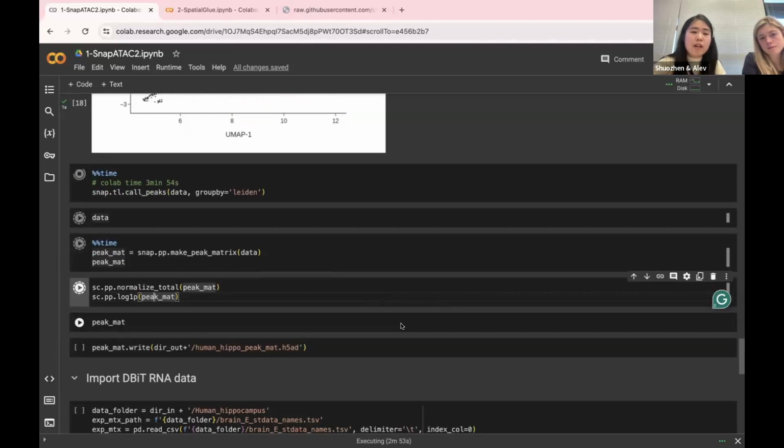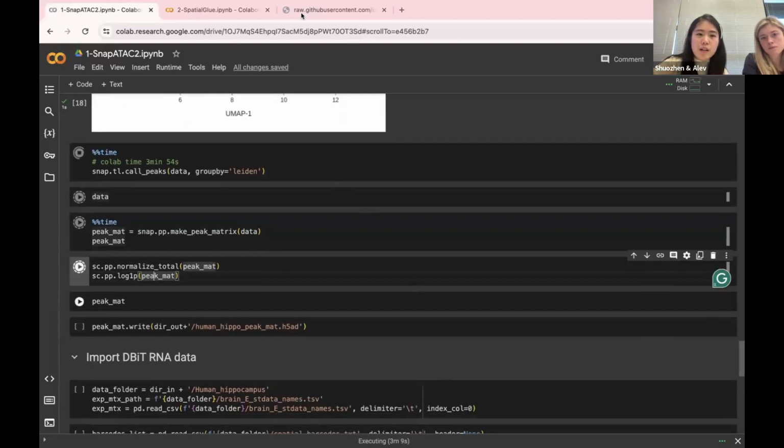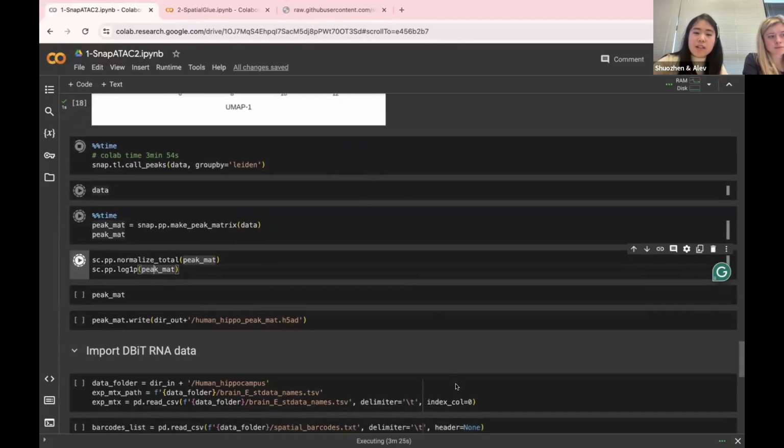each location should have their differentially expressed genes or different open accessibility of the chromatin, right? So even if it's a mixture of the cells, different locations should have different open accessibility. So we first do the ATAC data analysis using the single cell pipeline. And then, once we have the unsupervised clustering of those differential features, we map it back to the spatial location. With the spatial location, we can do the pseudotime analysis and also the gene regulatory network to see whether, with the spatial context, they're showing the trajectory of organ development or disease progression. We'll talk about that in detail while we are running the spatial part.